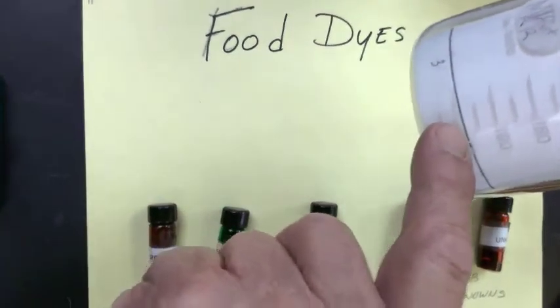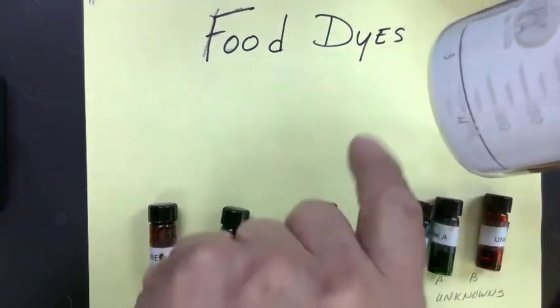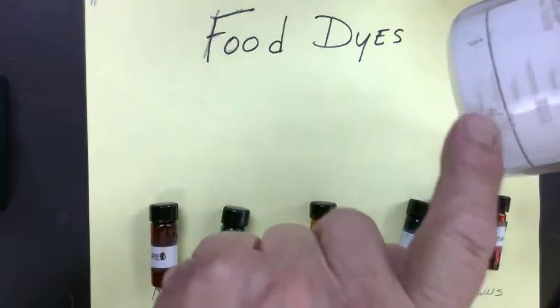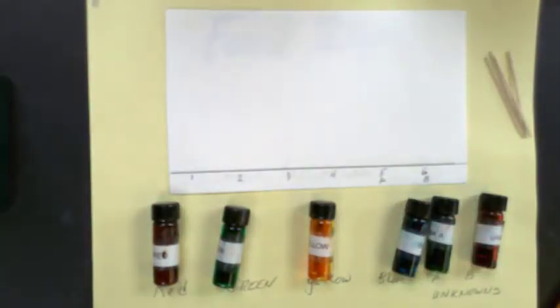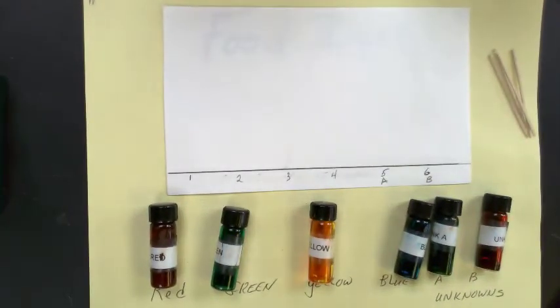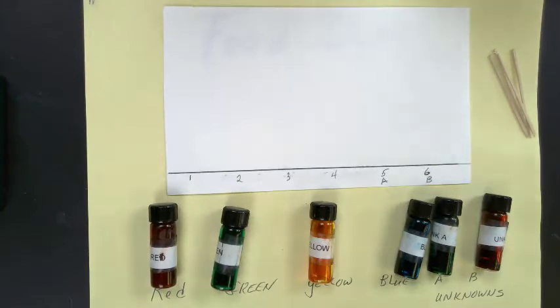If my liquid touches that line, that means the samples will go into the liquid and not up the chromatogram. So I have to know approximately where I want that to be, so I put the line on it. Now you always use pencil to do the line. If I had used ink, the ink would have developed and spread with the whole chromatogram, and it would have been just an utter mess. So you have to use pencil.